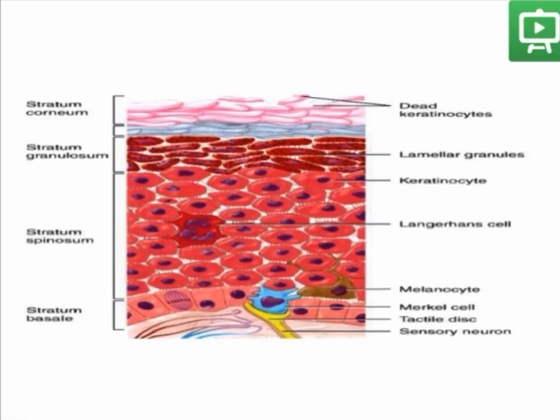Here is a section of keratinized epithelium composed of stratum corneum, stratum granulosum, stratum spinosum, and stratum basale.